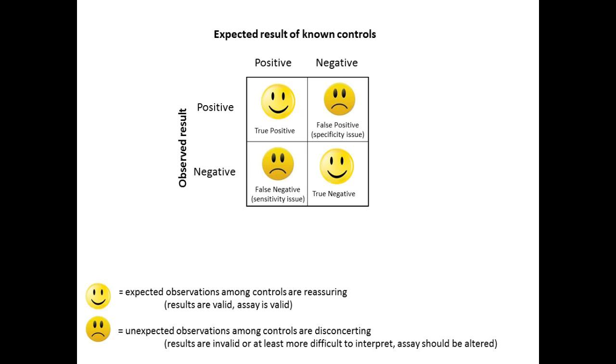And there's one test that we do run, and if you don't run it properly, you don't know if you're testing for that enzyme or if the metal loop that we use is causing the reaction. It's called the catalase test. That enzyme can be turned on by your organism or it can be turned on by metal. So you have to perform that test properly so that you don't have a specificity issue and don't get a false positive result.